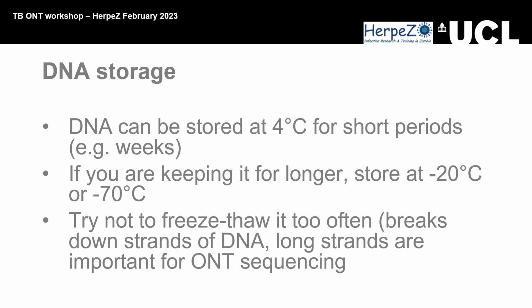So this workshop and this protocol is not the literal best, but it's very much about whether we can do it cheaply, get good accurate results, and most importantly, whether people who aren't complete experts on sequencing and bioinformatics can do it as part of routine work. You might be a TB routine diagnostic person, you might be an epidemiologist. Not everybody is going to have bioinformatics skills. Hopefully what we'll teach you on Friday is a very basic intro, so you can go from those files all the way through to having a result: this is resistant to this, this, and this, and its lineage is this. That's the aim anyway.